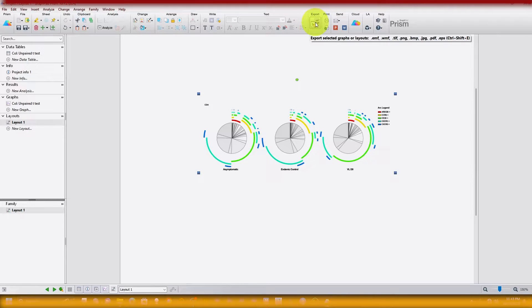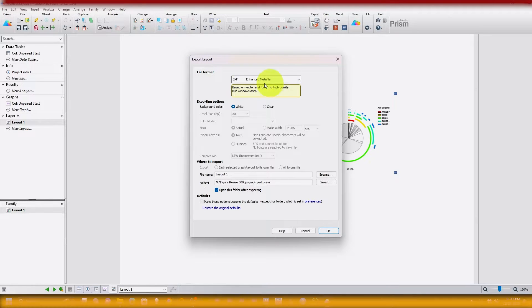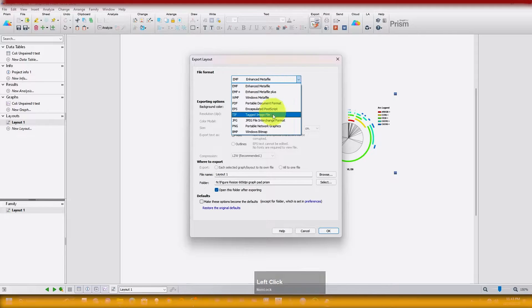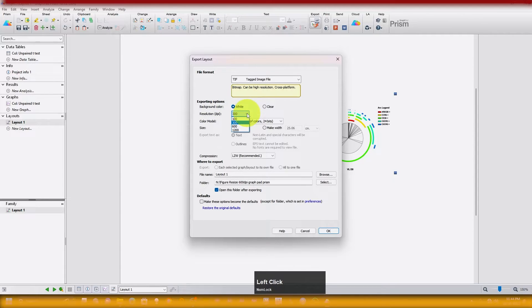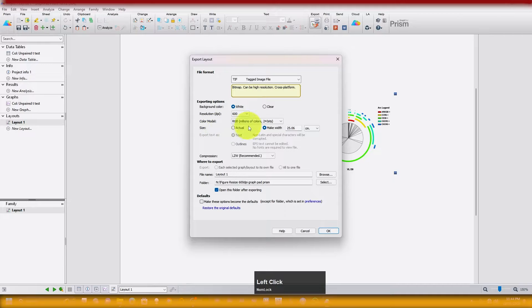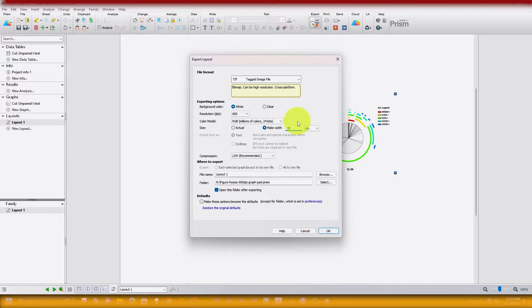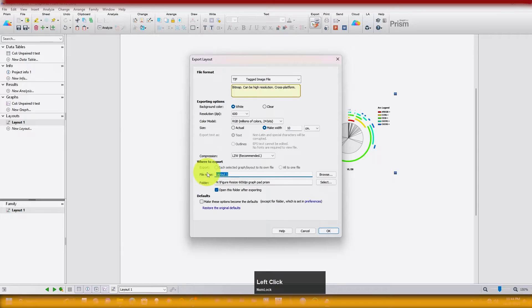Now I am going to show you how to export in your desired format and resolution. Click on the export option, which will open the Export Layout window. There is a dropdown menu where you can see format options for both raster and vector. I am going to select TIFF. You can also change the background color — select clear or leave it white. Here, change the dpi to what you need for publication; I am going to select 600. For the color model, you can change it if needed. The size option is very important — select the option to set your figure to a particular size. There is a centimeter option; I want the width to be 10 centimeters, so I will enter 10. Other options are available for compression, and you can rename your file — I am going to name it 'export1_600'.